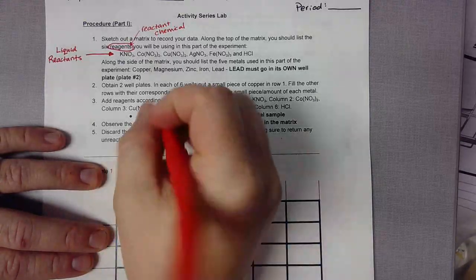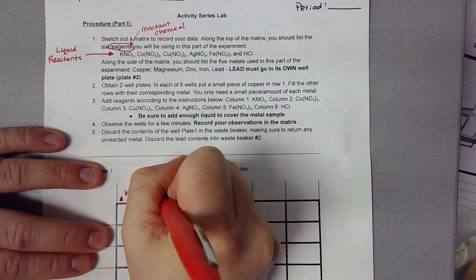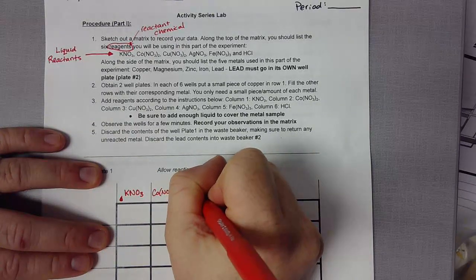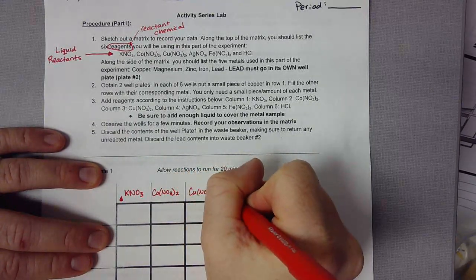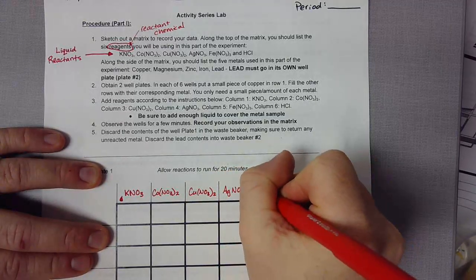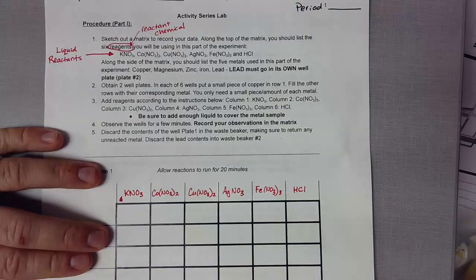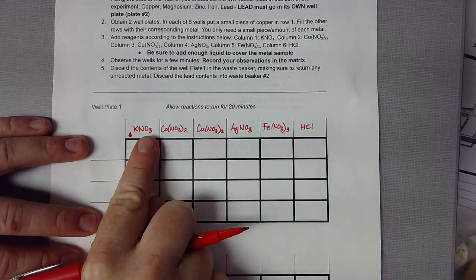Our second reactant is Co, big C, little o for cobalt, nitrate, Co(NO3)2, copper nitrate, silver nitrate, iron nitrate, and hydrochloric acid.